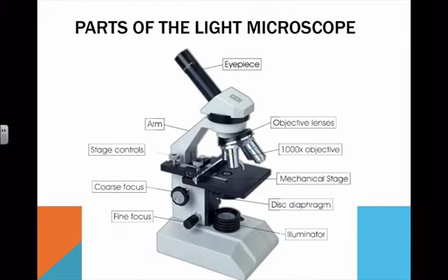So now let's go through more pieces of the microscope. We've talked about the eyepiece here. We've talked about the objective lenses down here. So there's other important parts you need to know about. One of them is the arm. The arm is located right here, and the arm is what we use to hold onto the microscope if we need to carry it around. We don't only grab the arm, but we also grab the bottom of it, which we call the base.